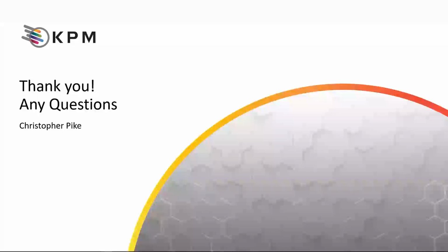What is the life of an NIR filter? Okay, so these filters, if the temperature is not excessive, if you haven't taken into account cooling an instrument, because you need to make sure the electronics, et cetera, are happy. But the filters themselves, we have used the same technology. As I mentioned, I've been doing this for 17 years, and filters have never been a discussion point outside of someone that may have installed it in an excessively hot environment. But typically other things fail before it gets to that point. But no, there's nothing to be concerned about with the filters.